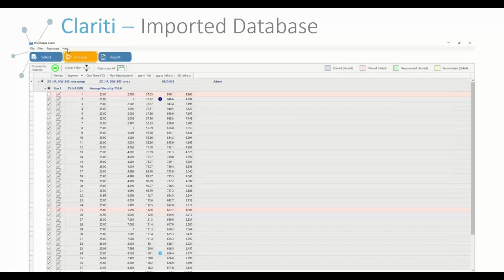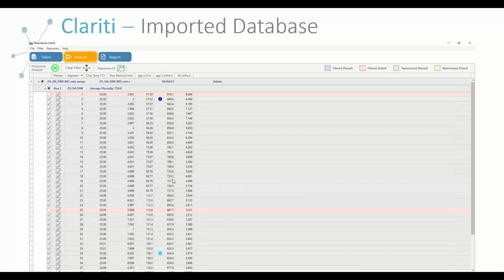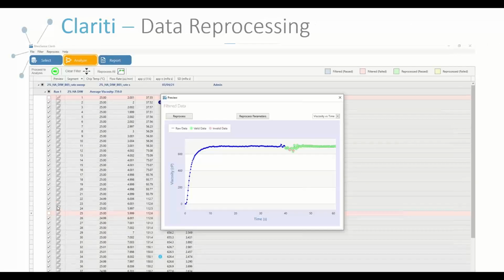Then when you select the Analyze tab, it will move over to the next window, and you can see all the data points that the instrument read out and exported into Clariti. In a bit, I will go through what all of these mean and what all of these do and what it looks like and how to play around with it. I didn't want to do that with a series of hundreds of screenshots. That seemed kind of excessive. I thought it would be much more beneficial to you as a demonstration. So I'll show you that demonstration in a bit. But this is what Clariti looks like.